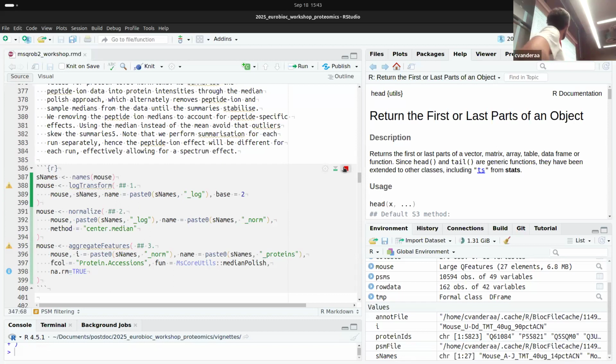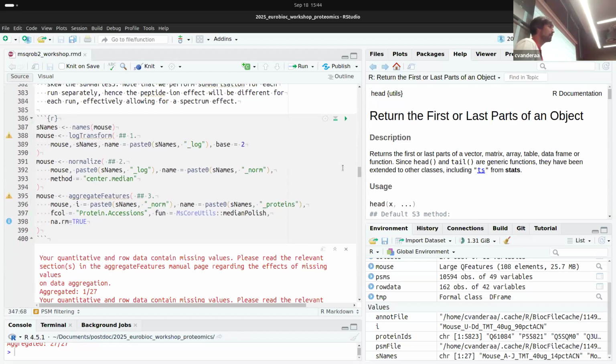In this case, this has been used by the authors. In an LFQ setting, we would definitely suggest robust summarization. Here, median polish is performed for every set separately. We subtract the medians for every row and the medians for every column in a separate run. So we partly account for the spectrum effects, that every spectrum can have different baseline information.